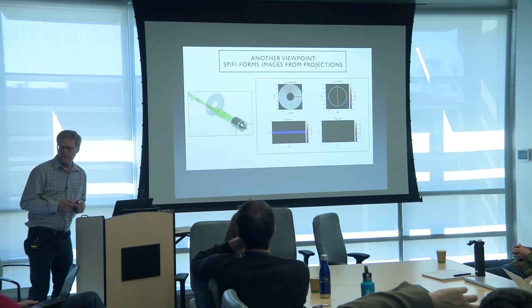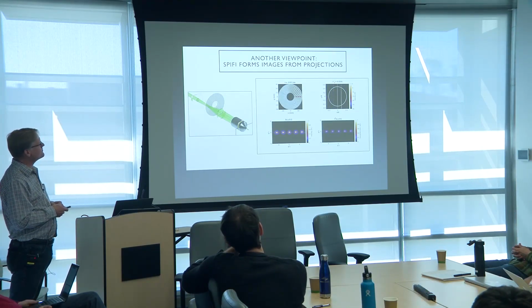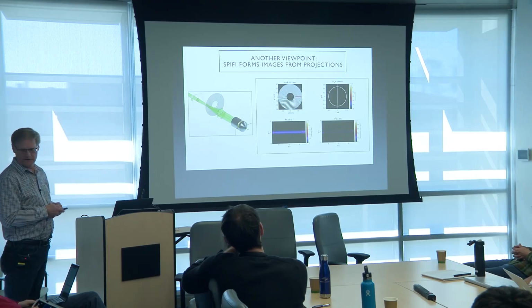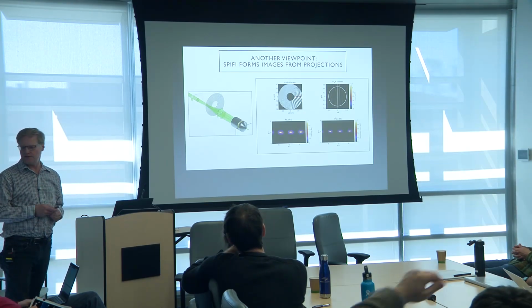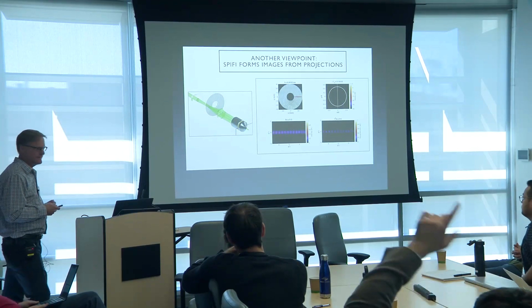So in terms of preserving photons, is there something that fundamentally prevents you from using a phase mask to generate that pattern? No, there's not, and you can, and there's real advantages to doing that as well.